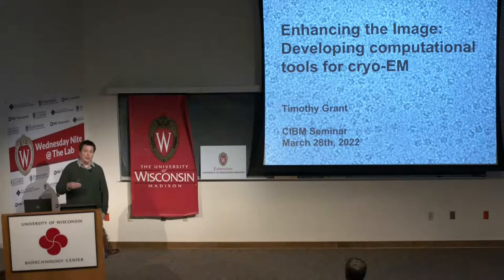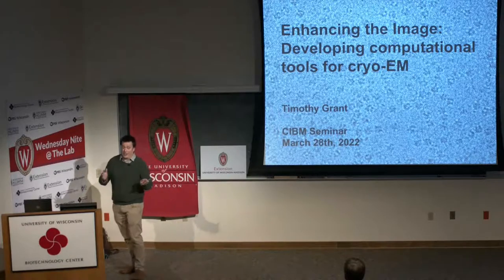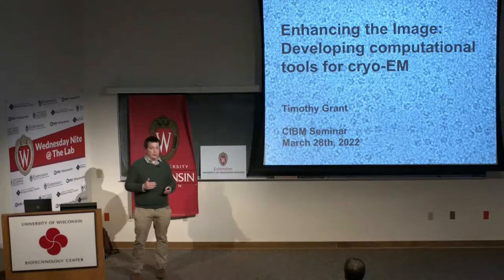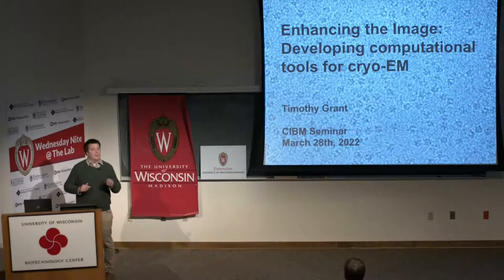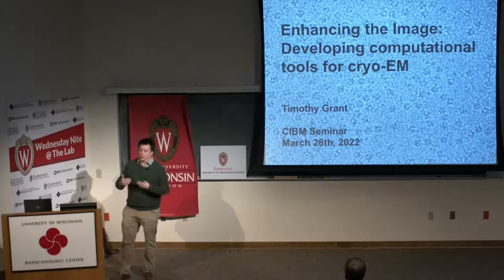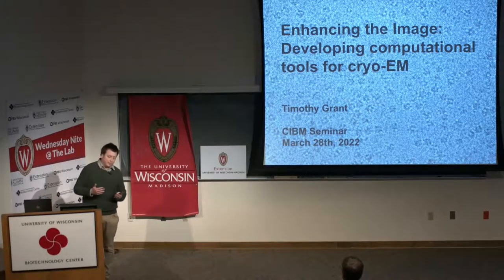So my research, both in my current lab and the research I've done in the past, has essentially been divided into two very connected paths, one of which is the development of methods, often very computational methods, for something called single particle cryo-electron microscopy. And I'll explain what that is in a bit of detail in a minute for those of you who don't know what it is. And then at the same time, I've spent a lot of time working, generally in collaboration with others, to solve biologically important structures, hopefully answer biologically important questions.